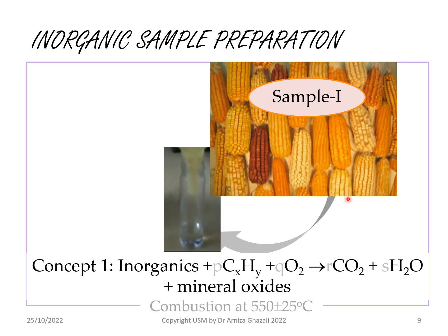So you need an instrumental technique that can handle high matrix interference to get data or quantify the tin in your sample which has been liquefied. Okay, so this reaction refers to concept 1 or combustion reaction. You get mineral oxide. You can also do this acid dissolution, get prepare sample with less interference and run analysis.